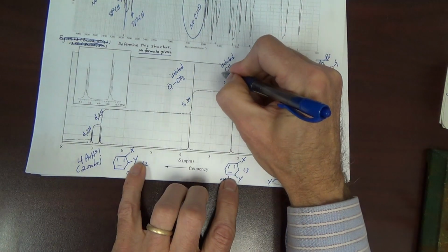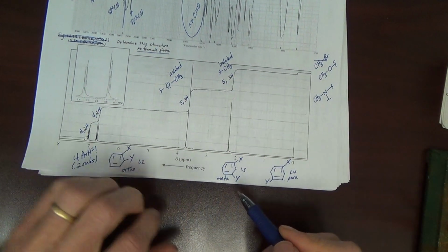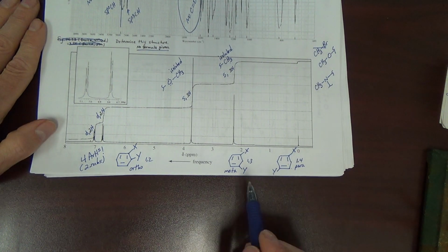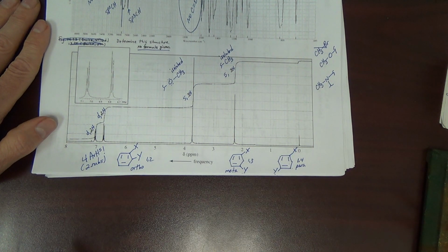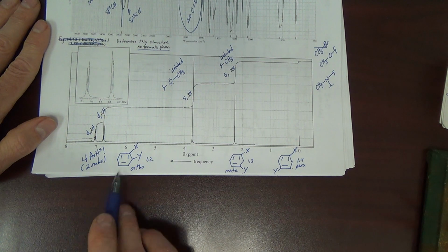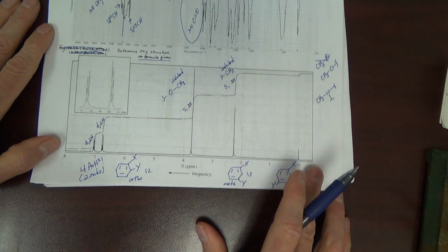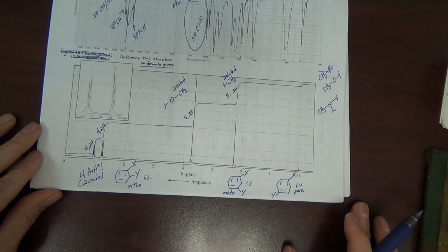We've got this, and now we have 2 fragments. I've got a methyl and a methoxy. This is the X and Y that go on this ring here. The question is really, what is the substitution pattern? That's what we need to decide, and then we just need to put the 2 groups. I'll let you think about that one further, and we'll finish it up in class. All right.